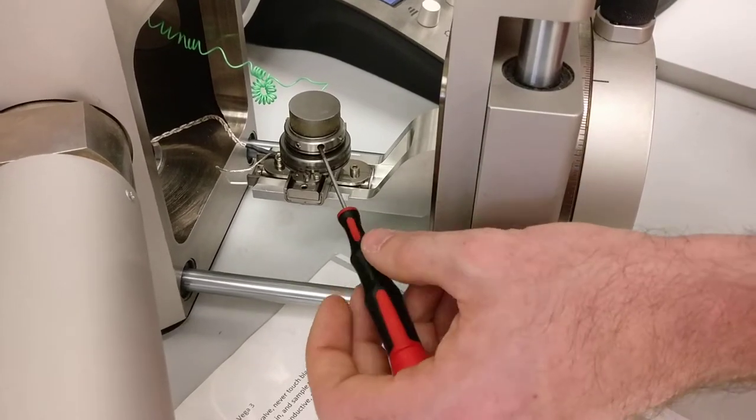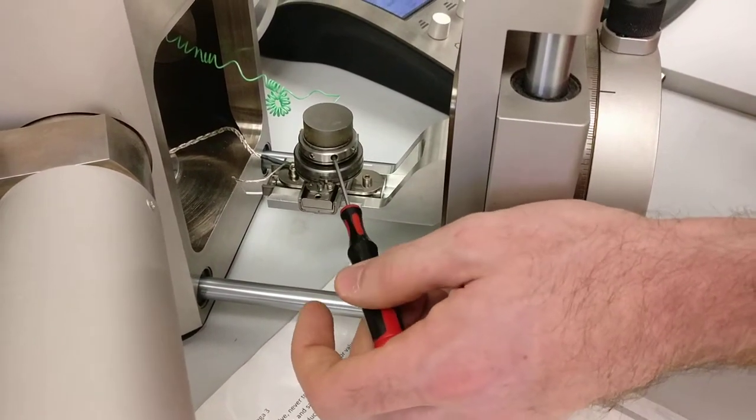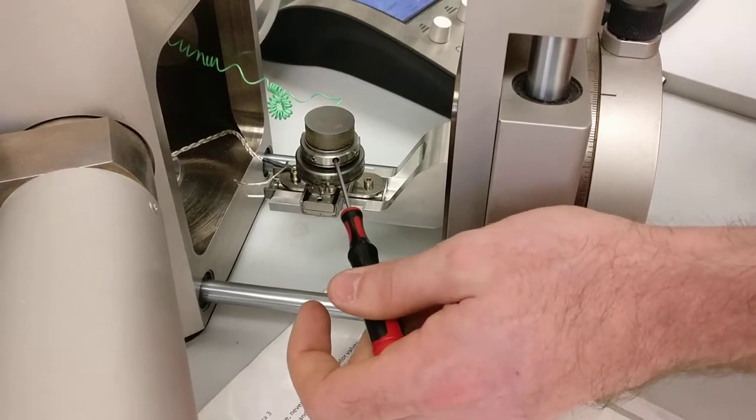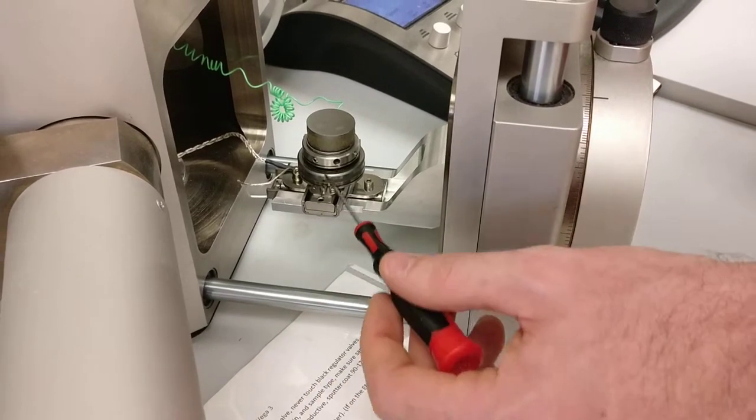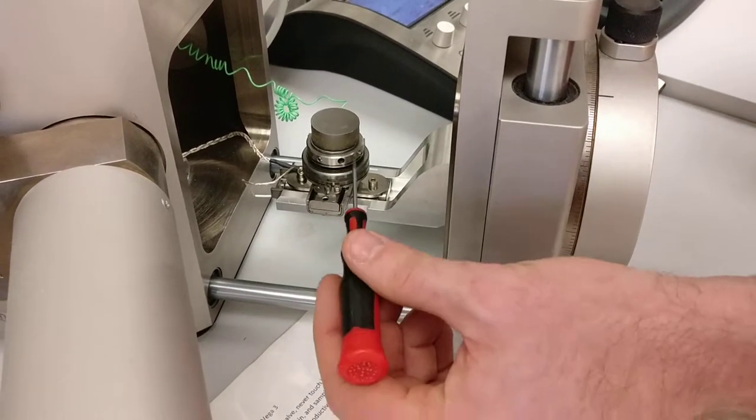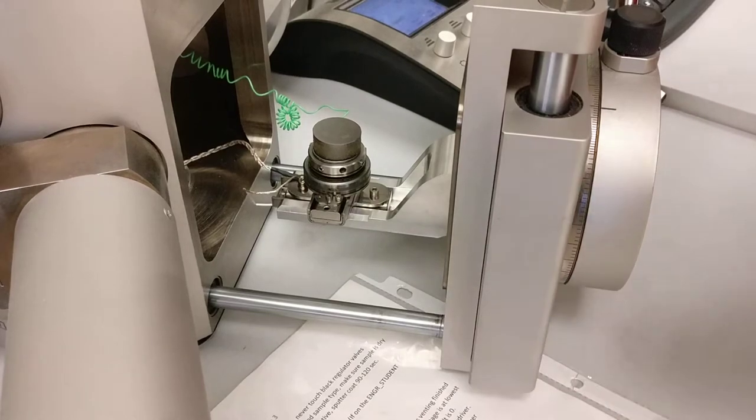Put the screwdriver in there and just tighten it up. And don't push too hard because these are on sliding tracks, so if you push it, it will slide along that track.